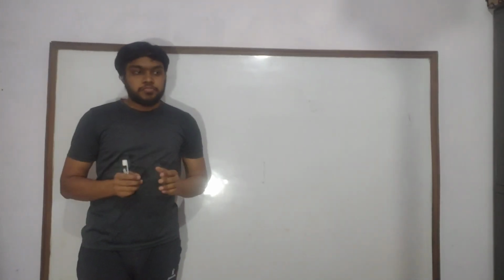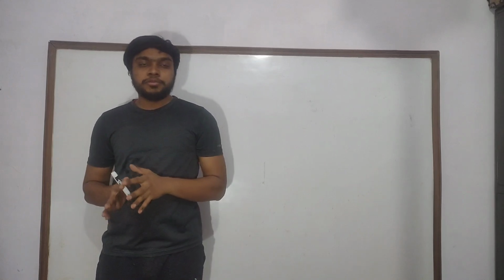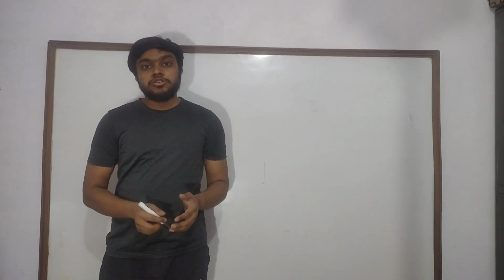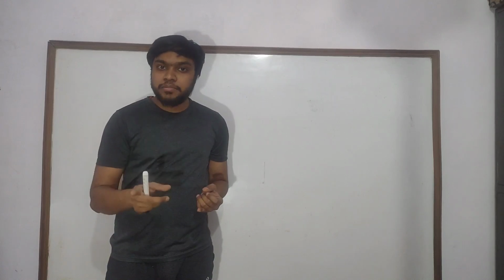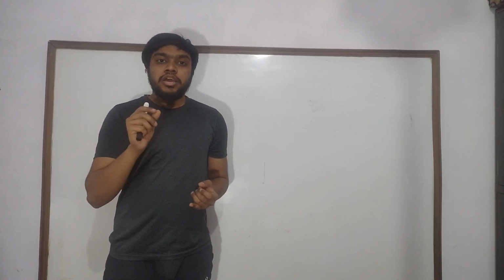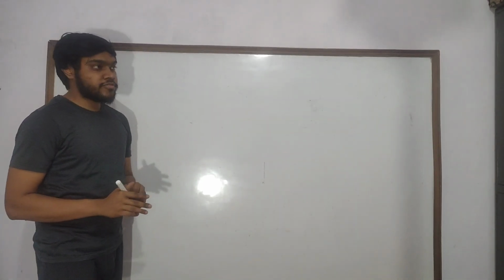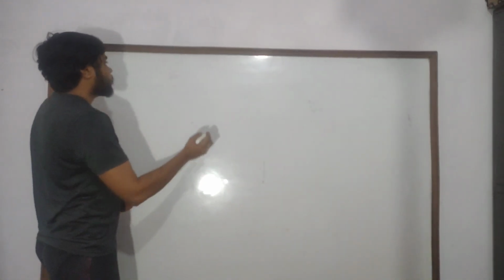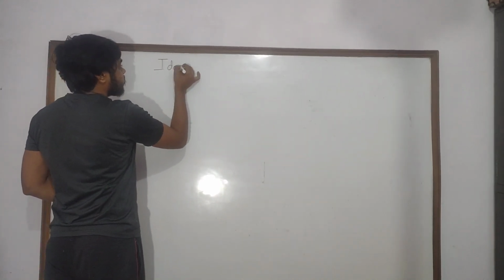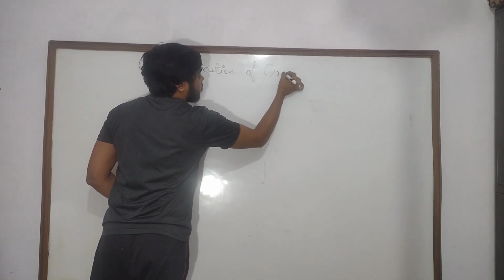So now I am going to start a series of practical chemistry or analytical chemistry. In that I will be starting analytical organic chemistry and analytical inorganic chemistry. So this is the first class of qualitative analysis of organic compounds. So first we will learn identification of organic compounds.